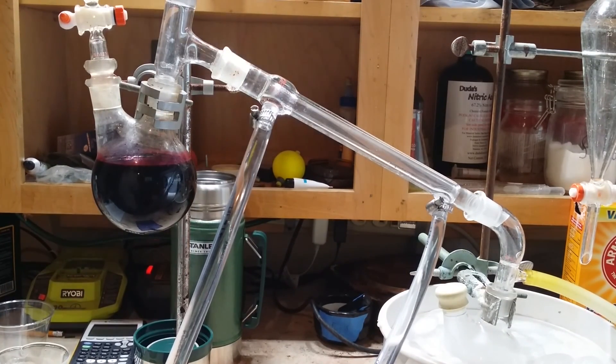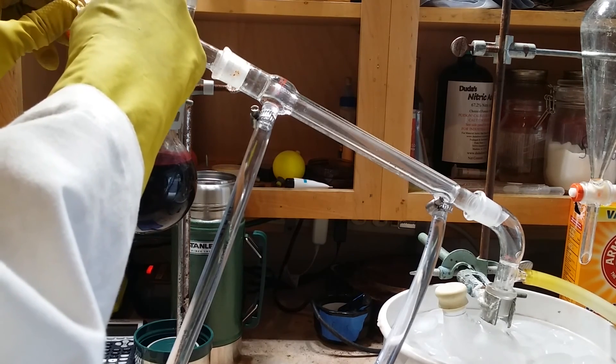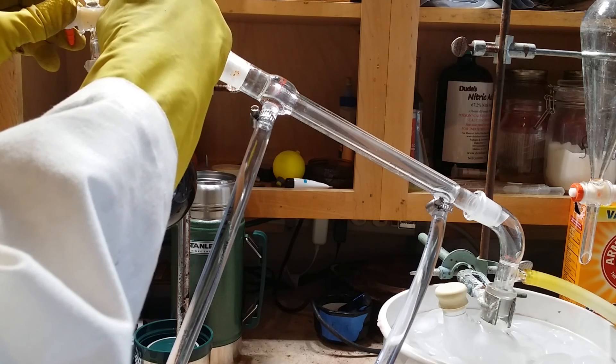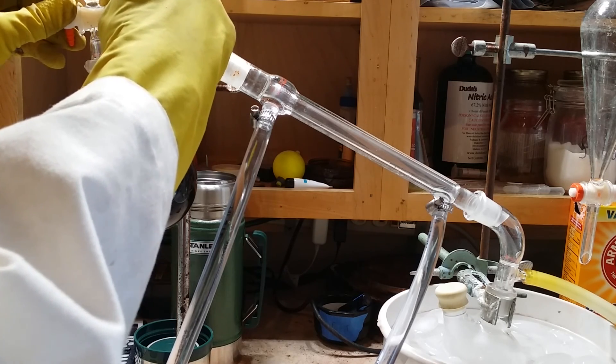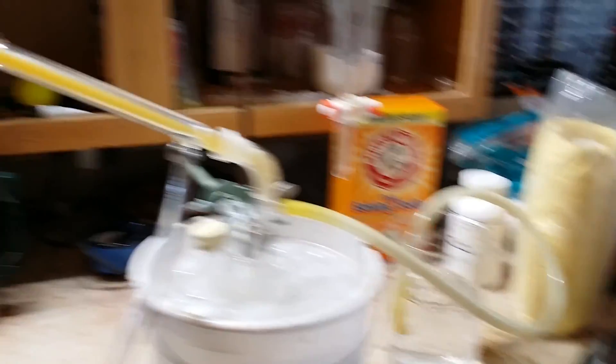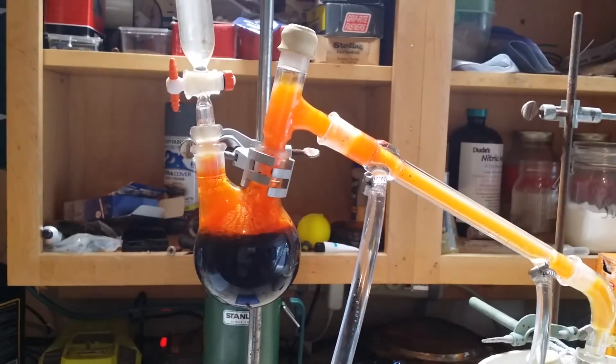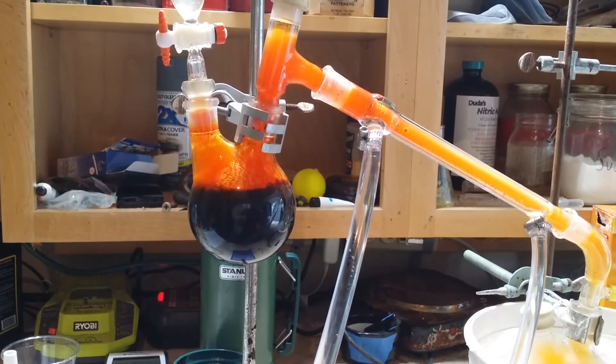Now that I've got the condenser tube connected and cold water flowing through it, I can start to add the sulfuric acid. You're going to want to add the sulfuric acid at a slow and controlled rate so that you don't overheat the system and don't lose too much bromine through the hose. Slowly open your addition funnel. You can see it's already bubbling, expelling the excess gas. Notice the red-brown vapor in there — that is bromine in gas phase.